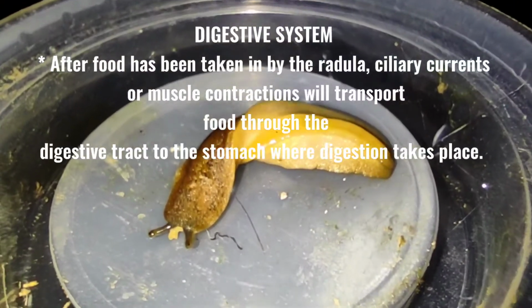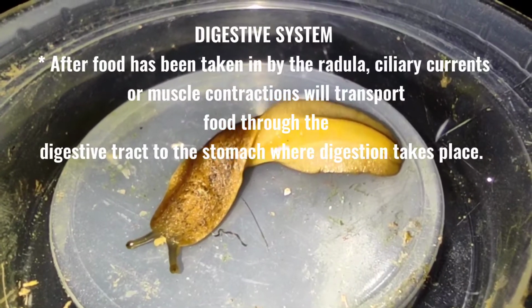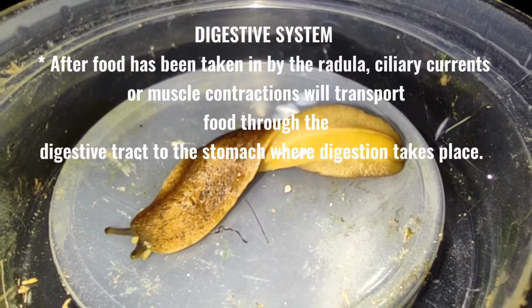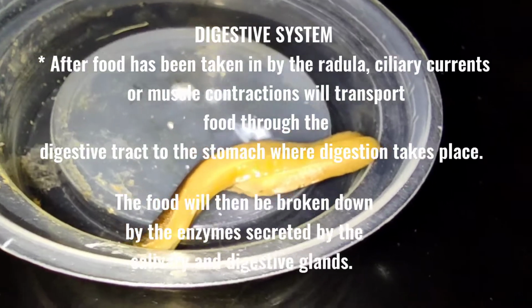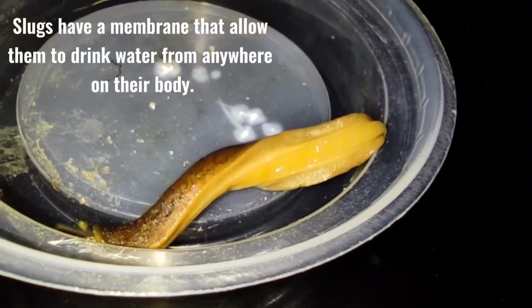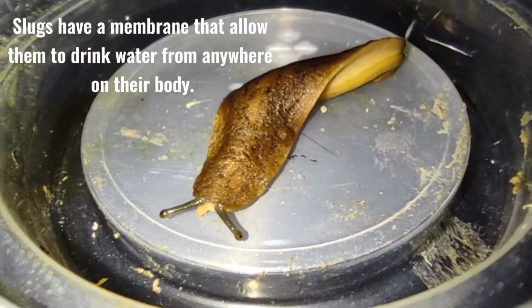After food has been taken in by the radula, ciliary current or muscle contraction will transport food through the digestive tract to the stomach where digestion takes place. The food will then be broken down by the enzymes secreted by the salivary and digestive glands. Slugs have a membrane that allows them to drink water from anywhere on their body.